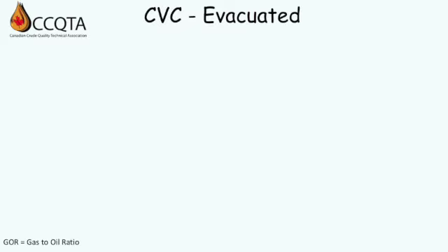Secondly, if there was sufficient vapor pressure to displace enough liquid, the sample had to be in two phases, gas and liquid, and some of the liquid had to be removed. This is an example of the impact of removing one phase preferentially over another. Keep in mind the values used are just for illustrative purposes.